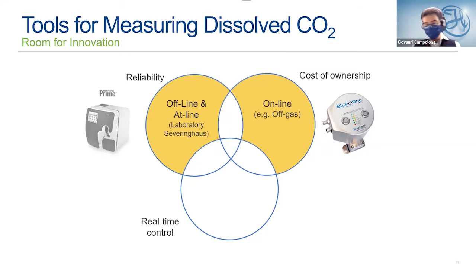And in a very clear situation that repeats itself, it may work. But if you, for example, start to scale up from the smaller size bioreactor to pilot to production bioreactor, like Kelsey was showing us before, it's not going to work anymore.